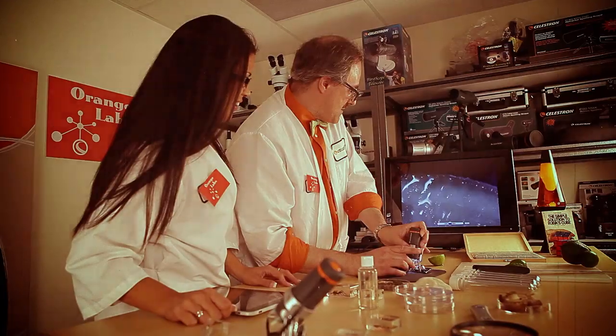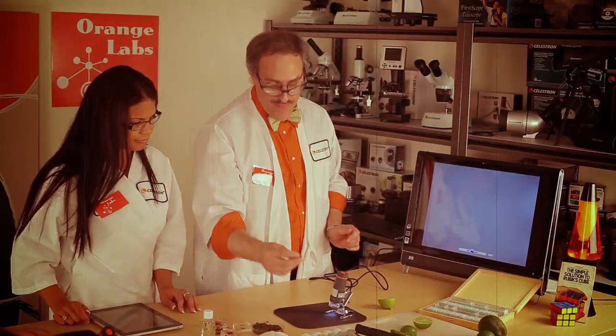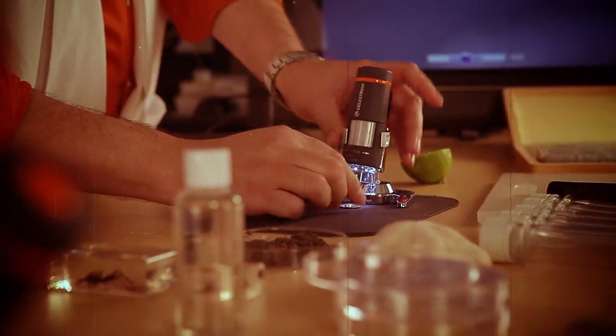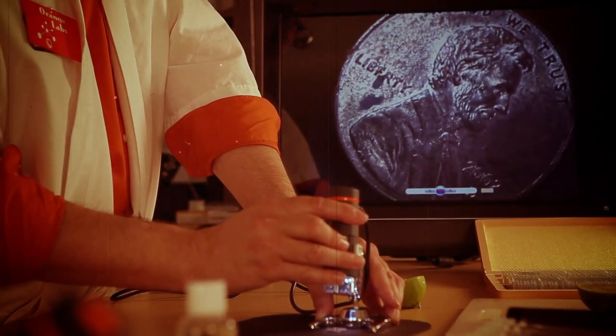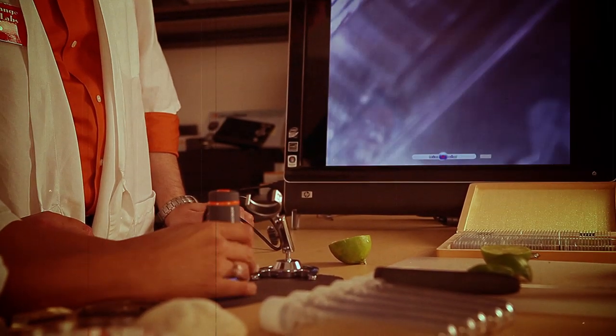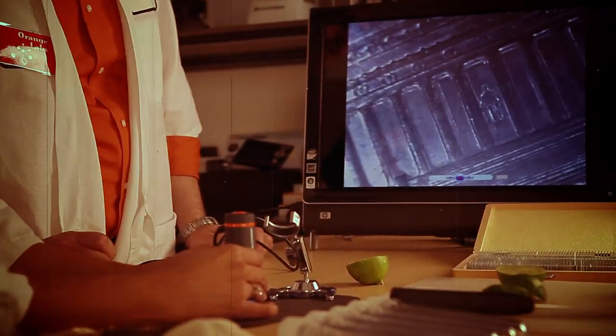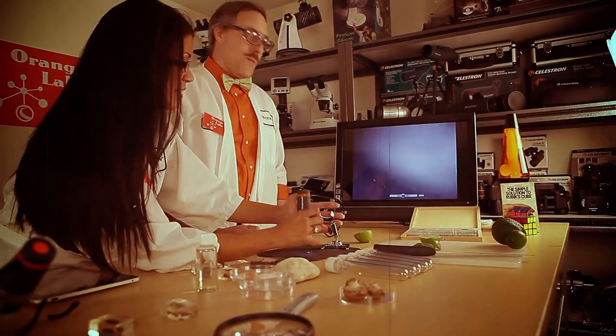The rind of the lime is the outer portion of the lime — the part that you don't eat. It looks really juicy. Let's try some other household items, like a penny. Wow, even at low power, Abraham takes up the entire screen. But I bet I know something you don't know, Professor — there's another Abraham Lincoln on the other side too. I see the Lincoln Memorial. He's right there, sitting in the center. I knew there was an Abraham Lincoln in the memorial, but I didn't know it was actually replicated in the penny. It's not counterfeit.